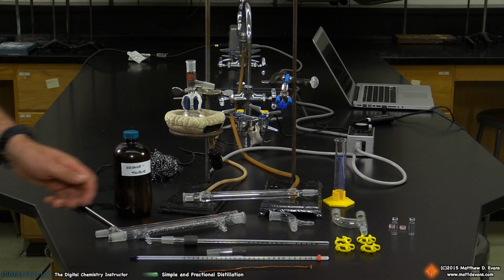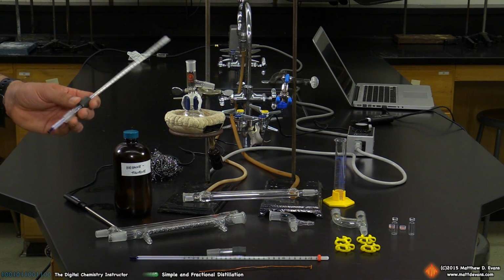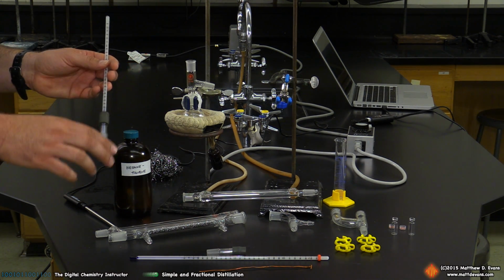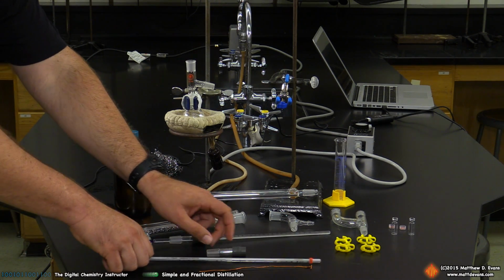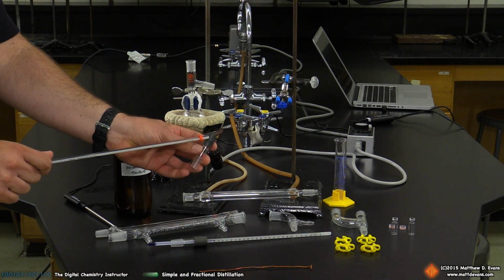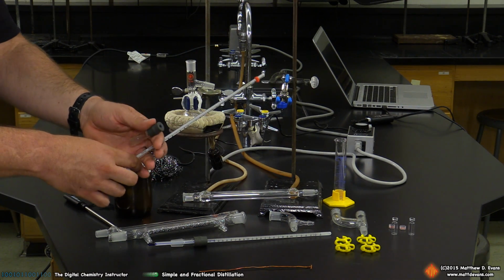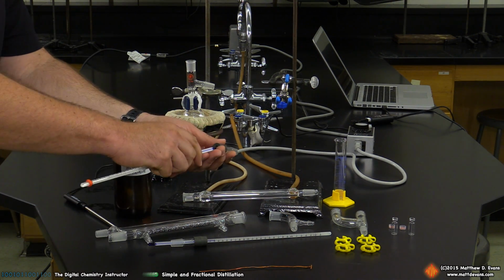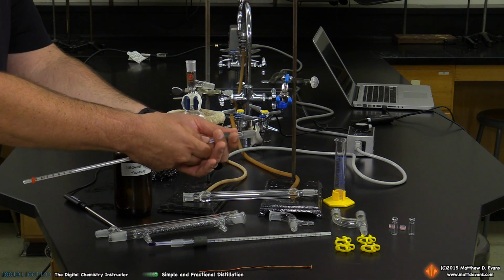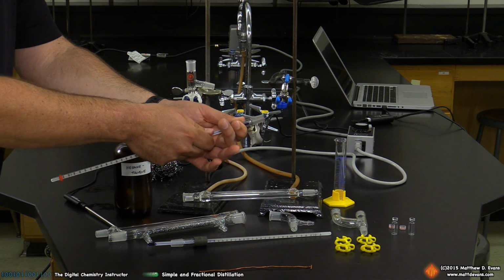Let me just say a few things about the thermometer in this setup. This is a standard thermometer. You can find these in the center bench. These are high temperature thermometers, and you should have a thermometer adapter in your drawer. Thermometer adapter is just this small piece of glass with a little grommet at the top. The safe way to put a thermometer into one of these is to grab it real close to the rubber piece and just kind of gently push this through.